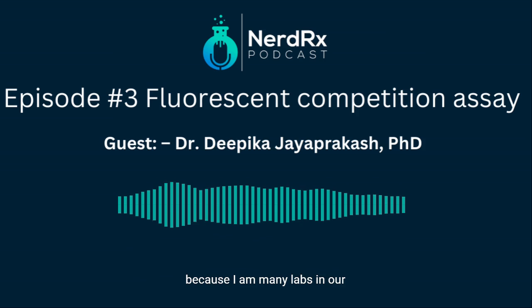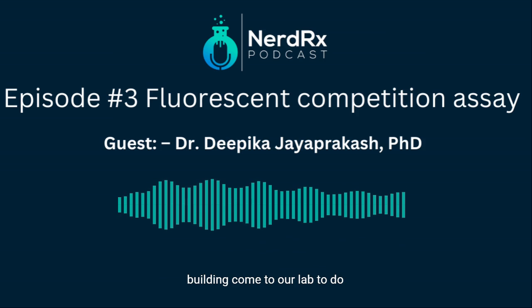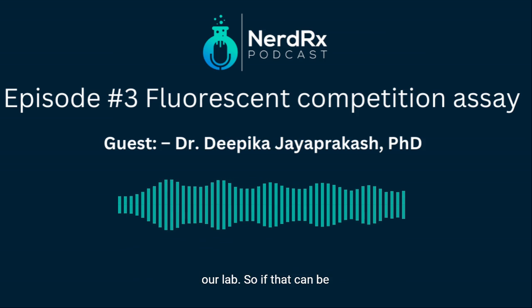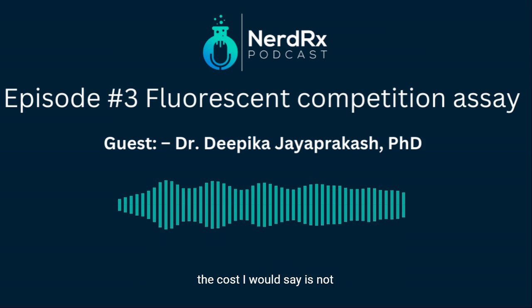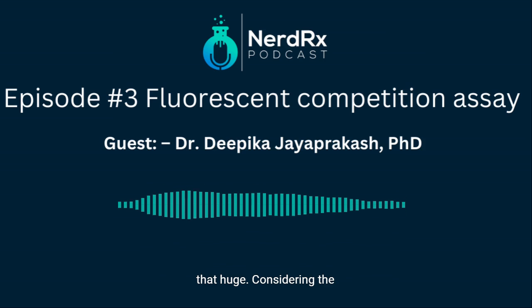Collaboration will also help, because I know many labs in our building come to our lab to do basic flow cytometry. So there can be cost cutting, and it would essentially be generating these fluorescent cell lines and doing it. So the cost, I would say, is not that huge, considering the other assays.